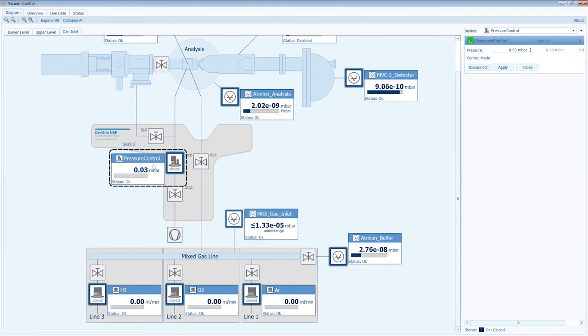So with this pressure controller, you can set the pressure which you want to keep inside the cell, and it will adjust the aperture to such a size that you have a dynamic mode in which you supply some gas and you evacuate this gas with some speed, and there is a set pressure inside the cell.